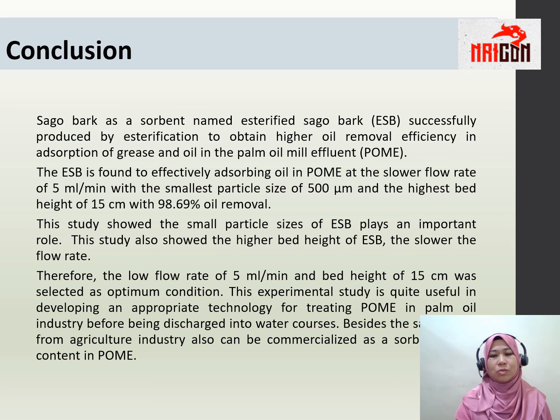This study showed the small particle size of ESB plays an important role. The study also showed the higher the bed height of esterified sago bark, the slower the flow rate. Therefore, the low flow rate of 5 milliliter per minute and bed height of 15 cm was selected as the optimum condition. This experimental study is quite useful in developing an appropriate technology for treating POME in the palm oil industry before being discharged into watercourses.